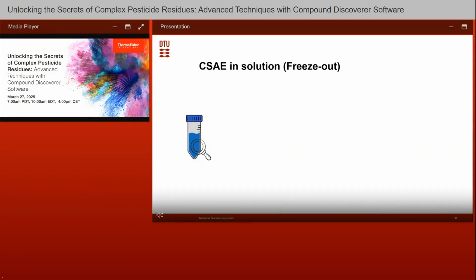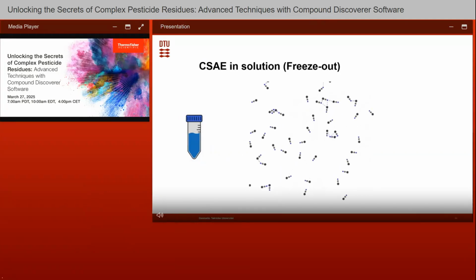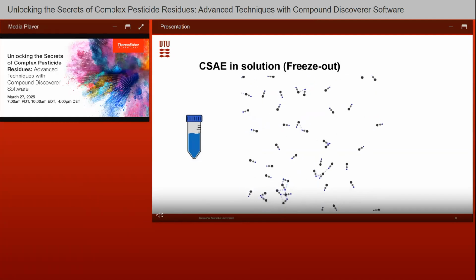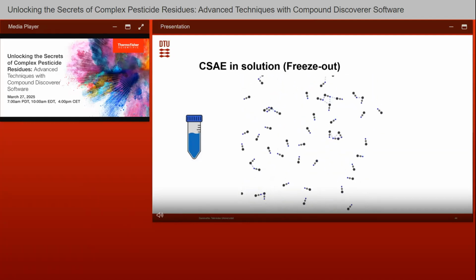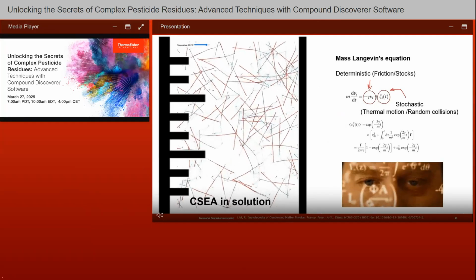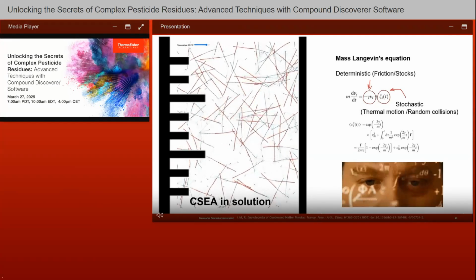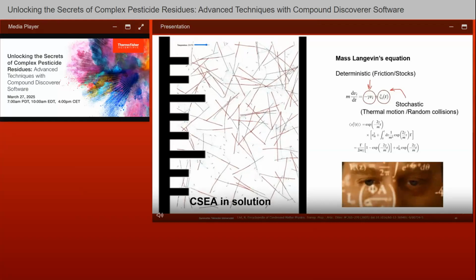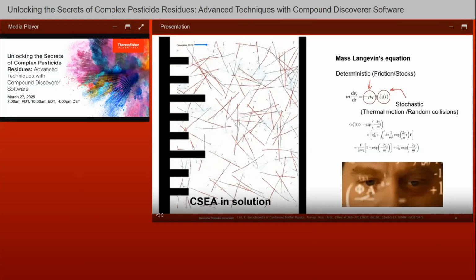When we take a look at the molecular level, taking place by the strong dipolar moment of the acetonitrile, the ethoxylated alcohols' behavior can be described, but we won't get into the intricate details of the motions played by this Langevin equation.